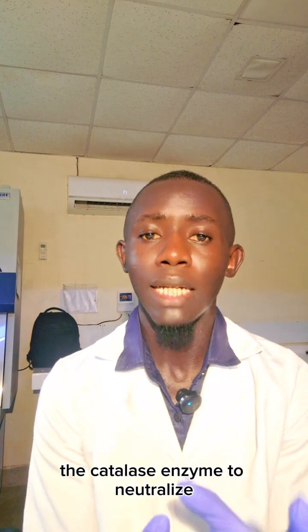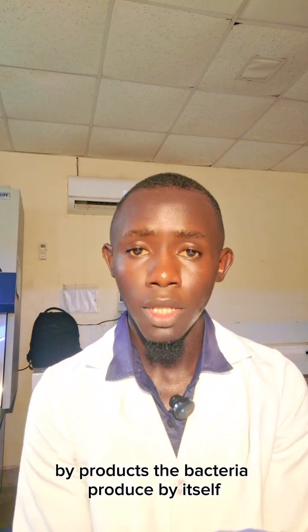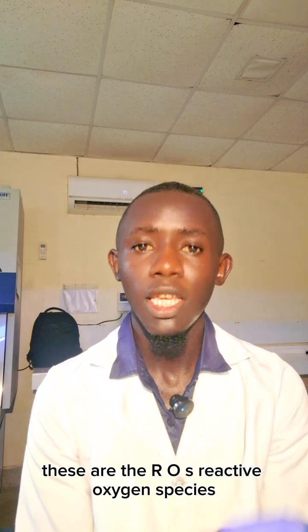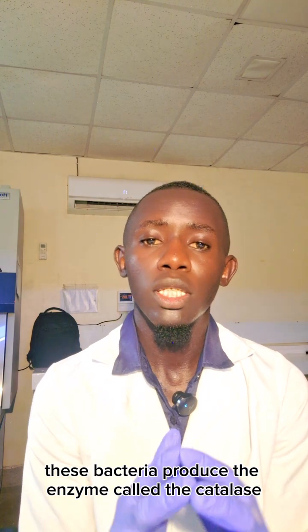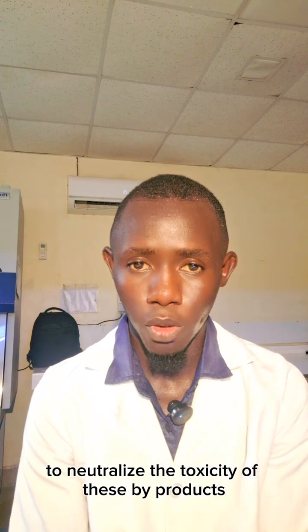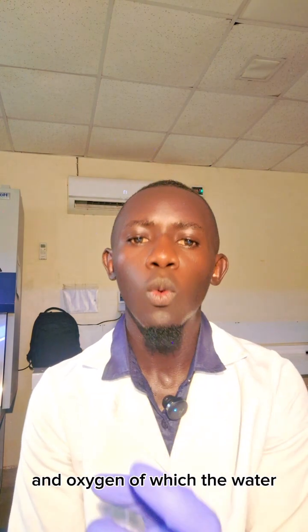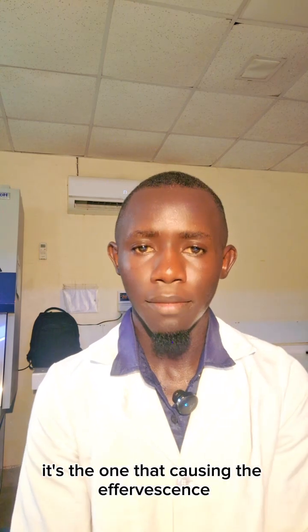Under the principle, the catalase enzyme works whereby the bacteria are able to produce this enzyme to neutralize the toxicity of the byproducts the bacteria produce by themselves. These are the ROS, reactive oxygen species, and the hydrogen peroxide products. These bacteria produce the enzyme catalase to neutralize the toxicity of these byproducts. Therefore, it converts the hydrogen peroxide into water and oxygen, of which the oxygen is the one that causes the effervescence.